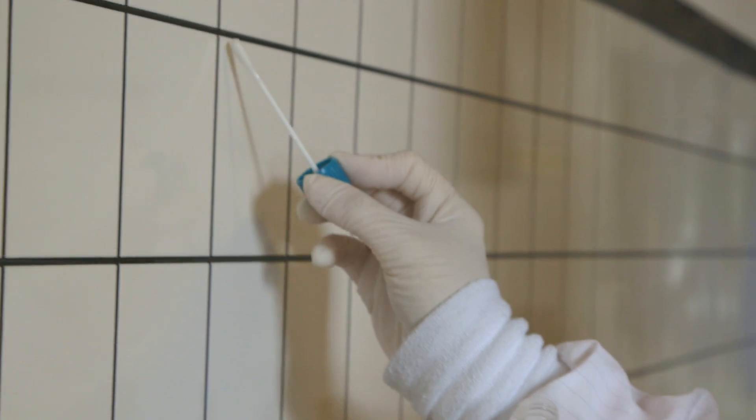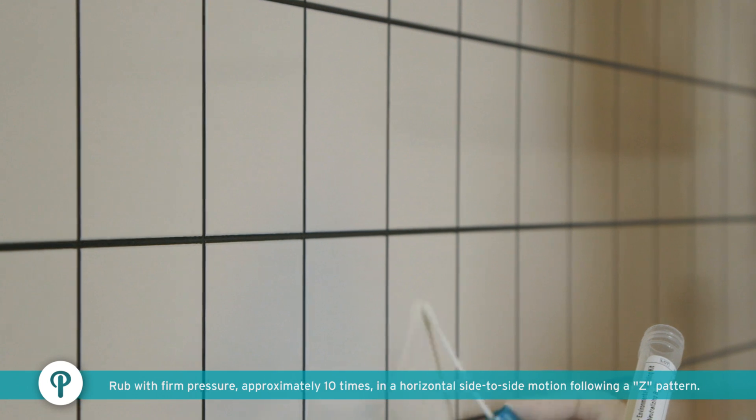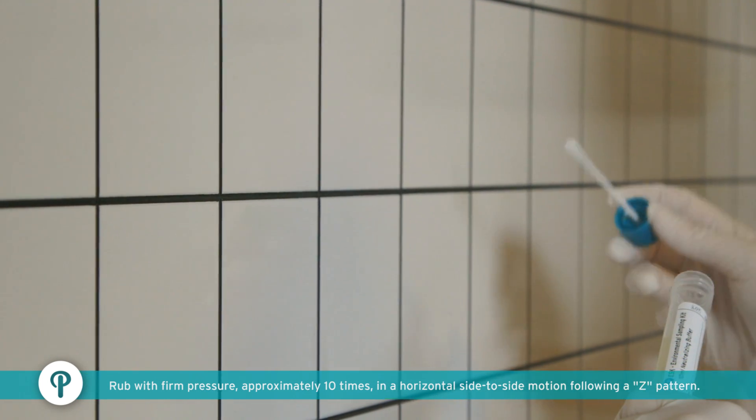Using one side of the swab, collect a sample in a 50-square-centimeter target area, or according to the established Environmental Monitoring Program. Rub the swab with firm pressure approximately 10 times in a horizontal, side-to-side motion following a Z-pattern.